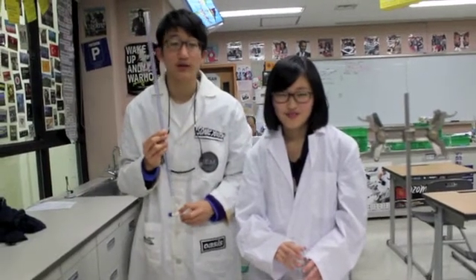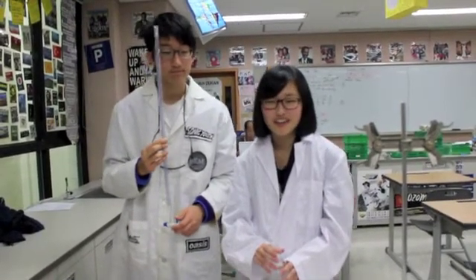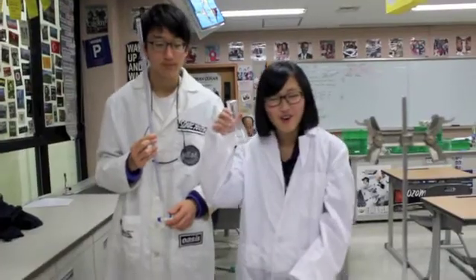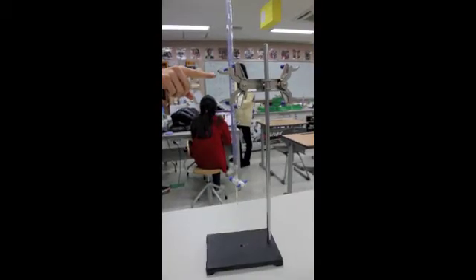A burette is used to measure the exact volume of a liquid. In this demonstration, it will be used to carry out an acid-base titration, which is the most common use of burettes. An Erlenmeyer flask is most often used in titration.